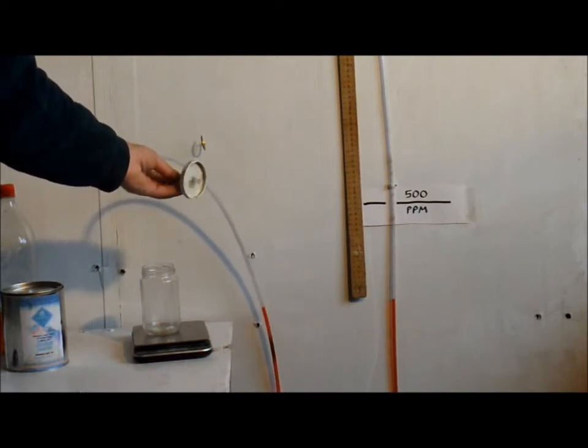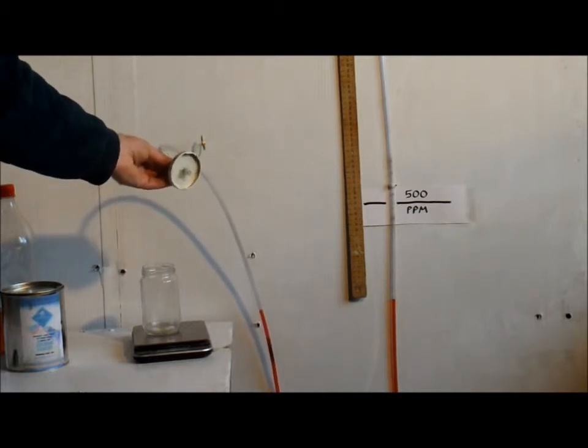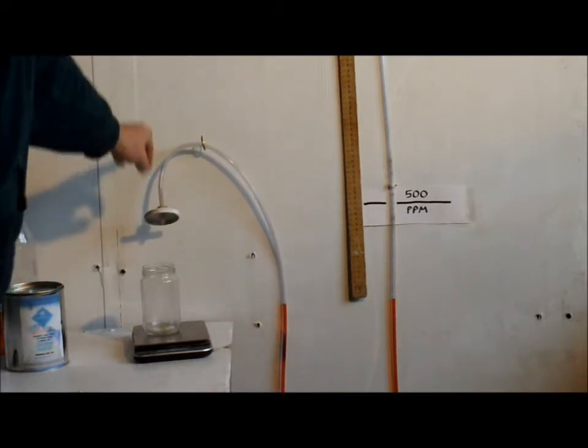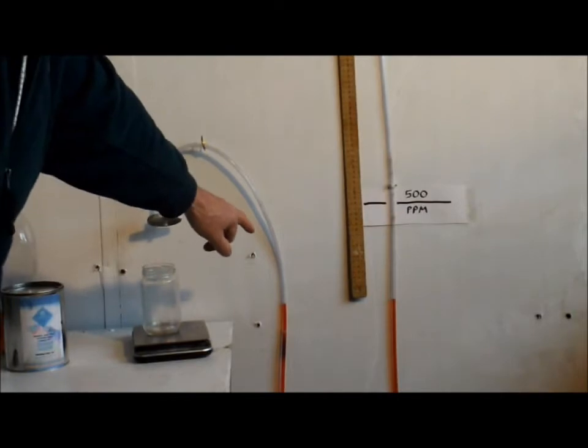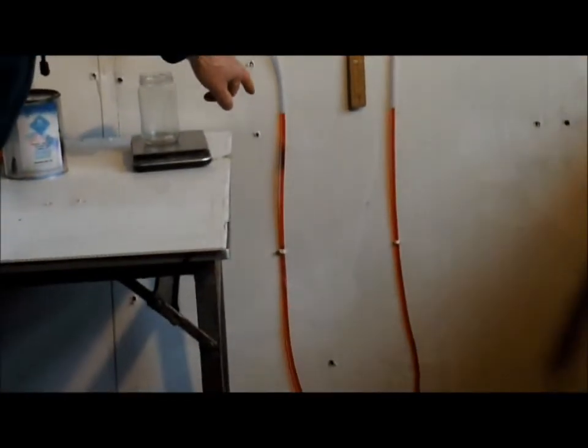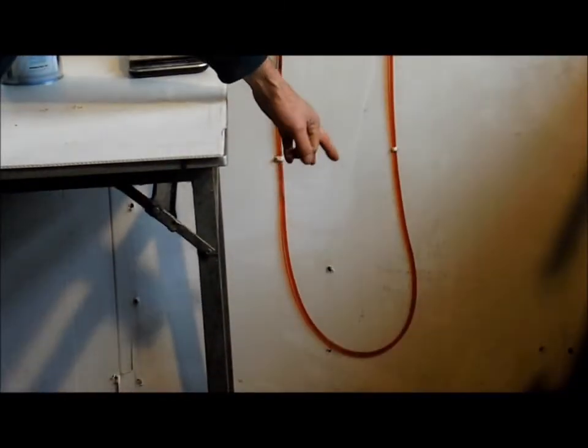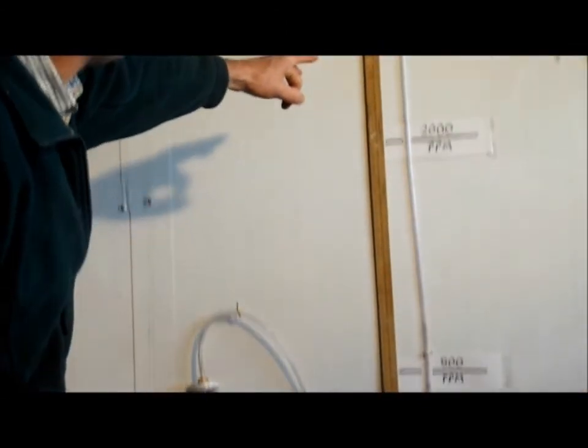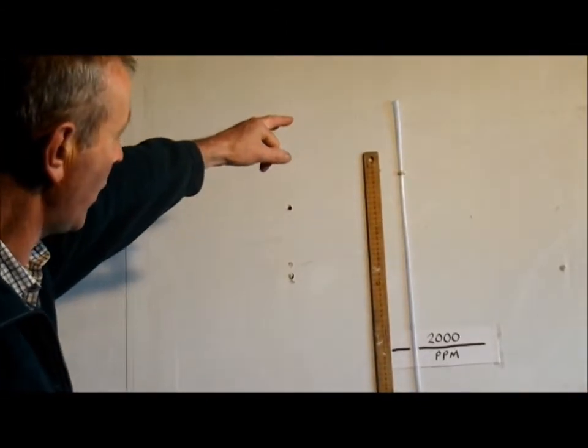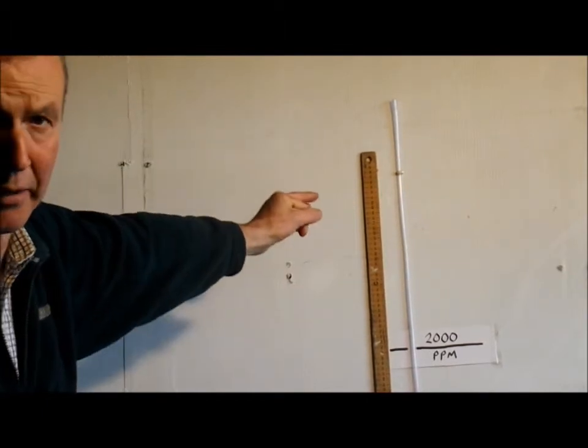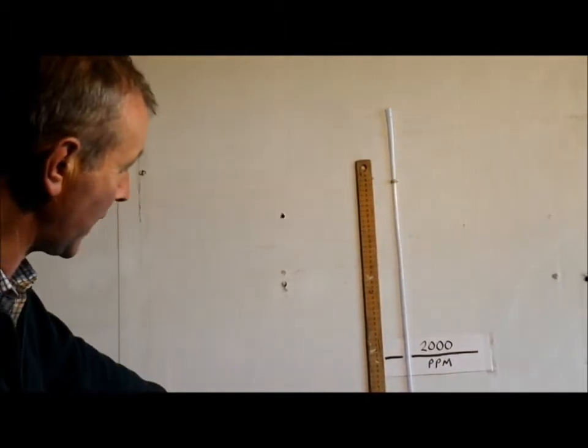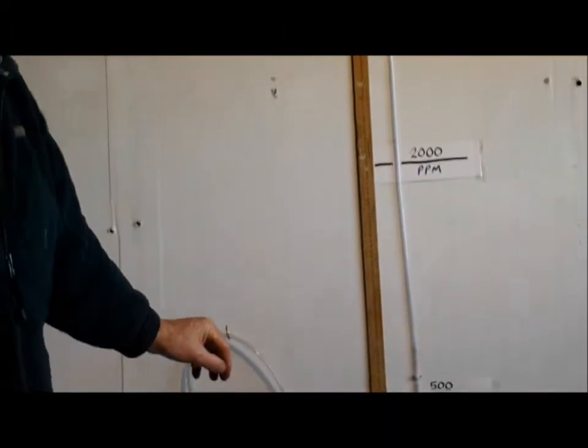Once it has set, arrange the tube down here in a loop, going down about 2-3 feet, coming back up again and then going up the wall about another 3-4 feet. You can fix it in place with small cable clips.